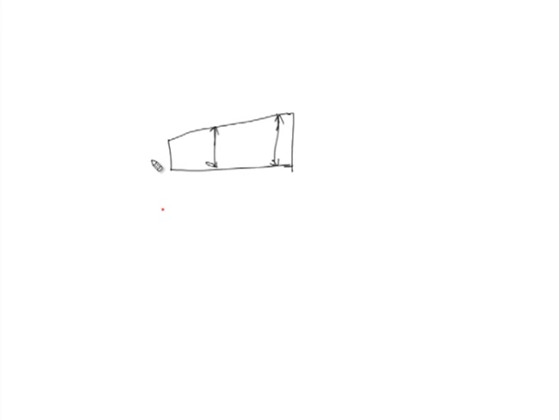When this is filled with a homogeneous solution, there is no boundary as such, and so no refractive index changes are registered. But as centrifugation occurs and the centrifugal force is in this direction, the macromolecule starts moving towards the centrifugal end because of the centrifugal force. So, a boundary is created, and this area here is now devoid of the sample.